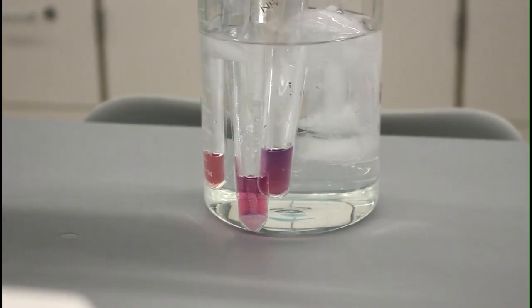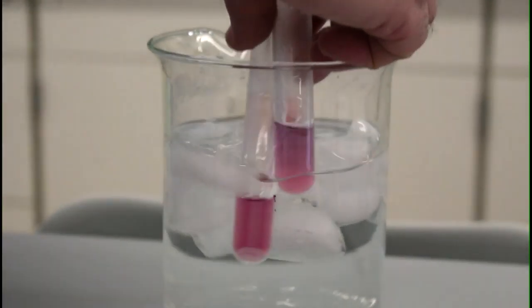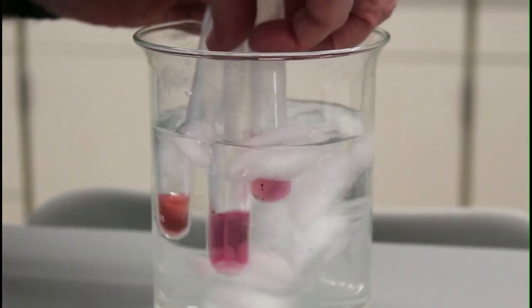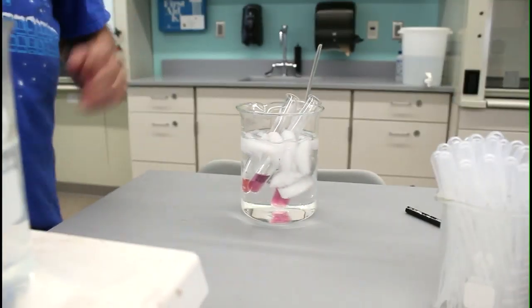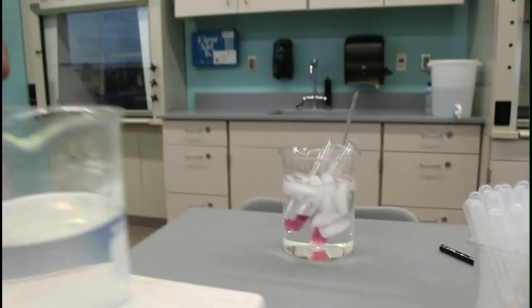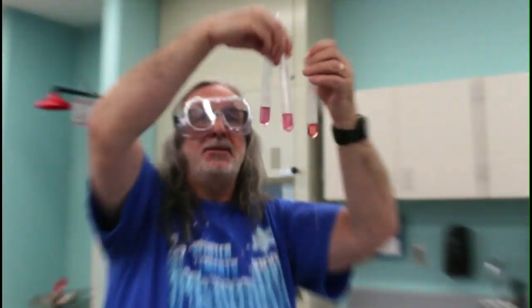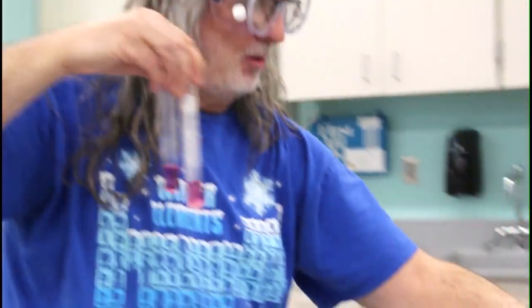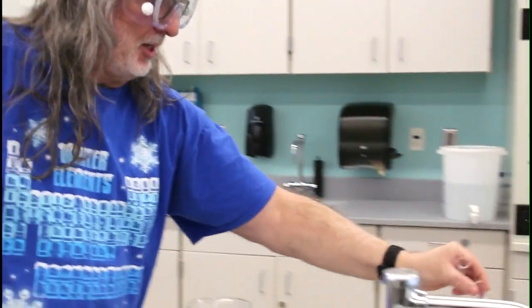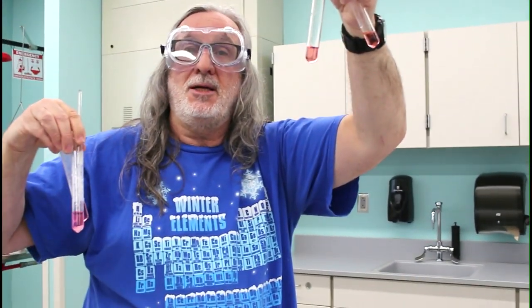And lo and behold, as they're cooling down, what are you seeing? That color seems to be going back to pink. We're putting them in an ice water bath, we're cooling them down, we're taking heat away. What's going on in terms of Le Chatelier's principle? That's what you need to explain. Okay? They want the HCl, they want the ammonium chloride, the control, and of course, whoops, that's deionized water, my room temperature control. Very good.